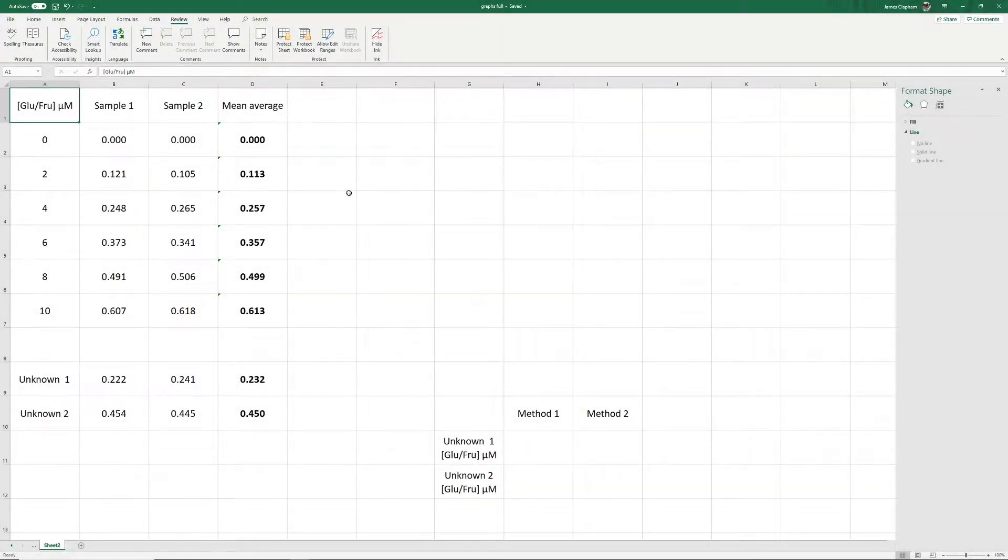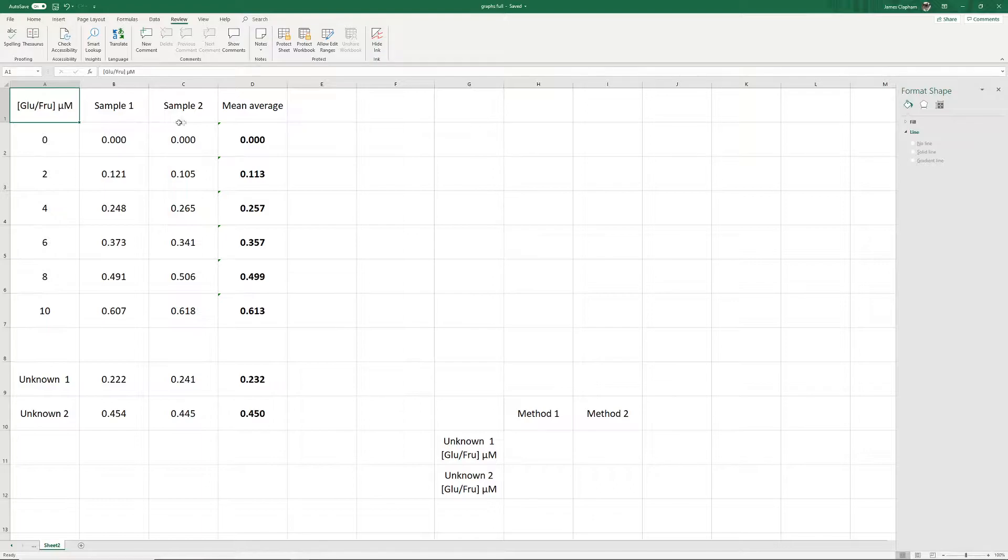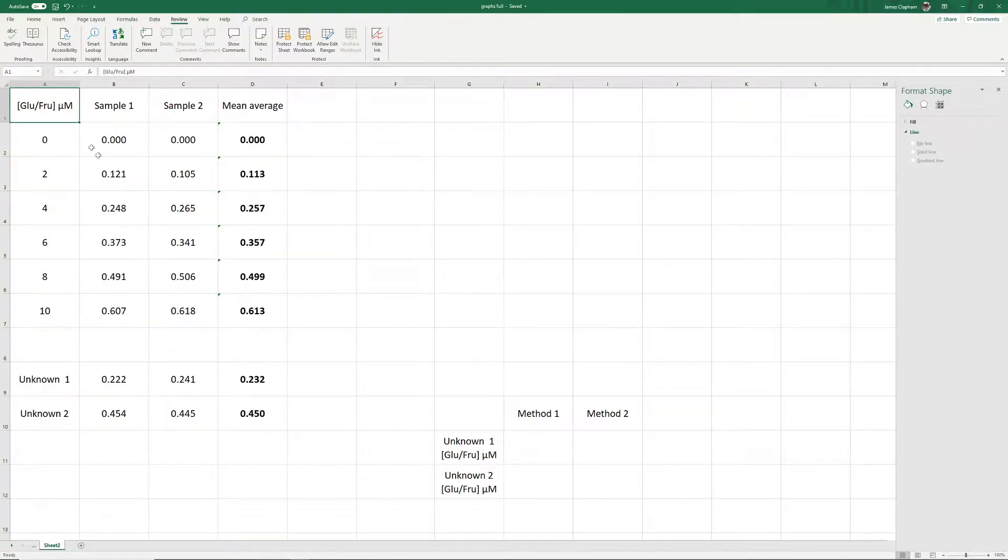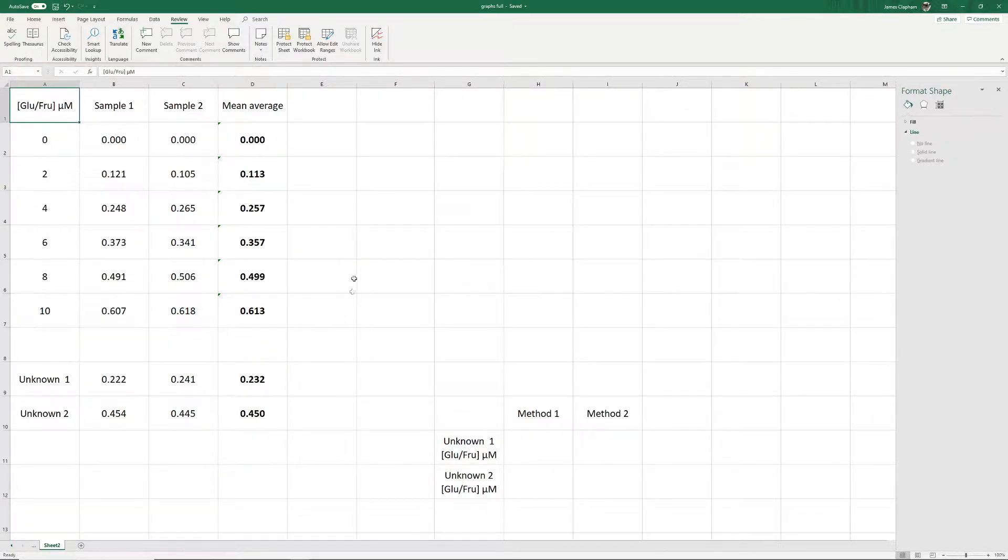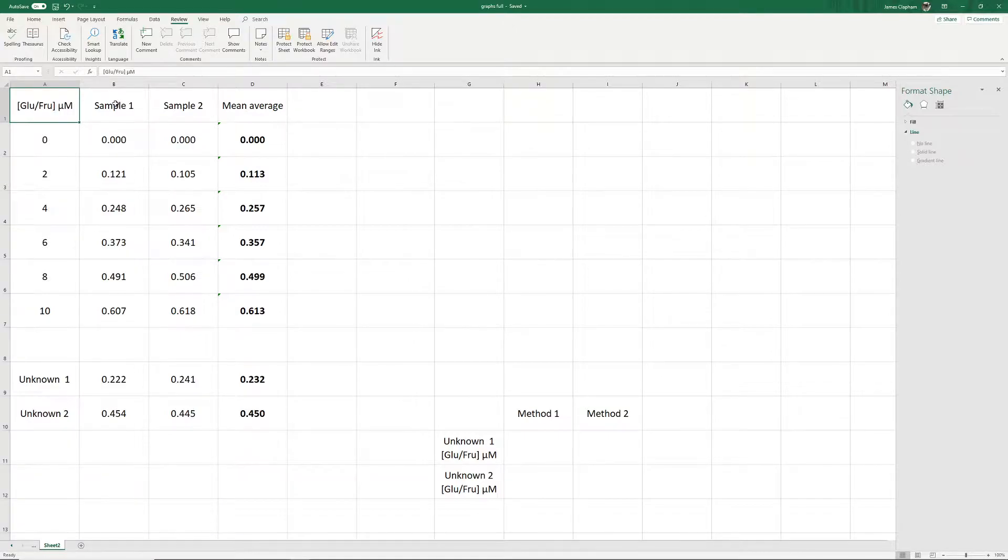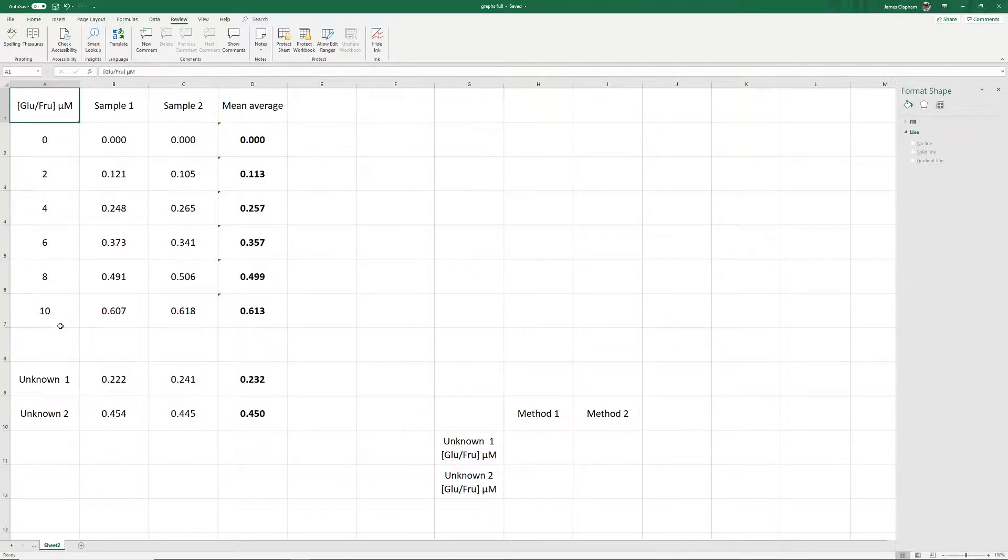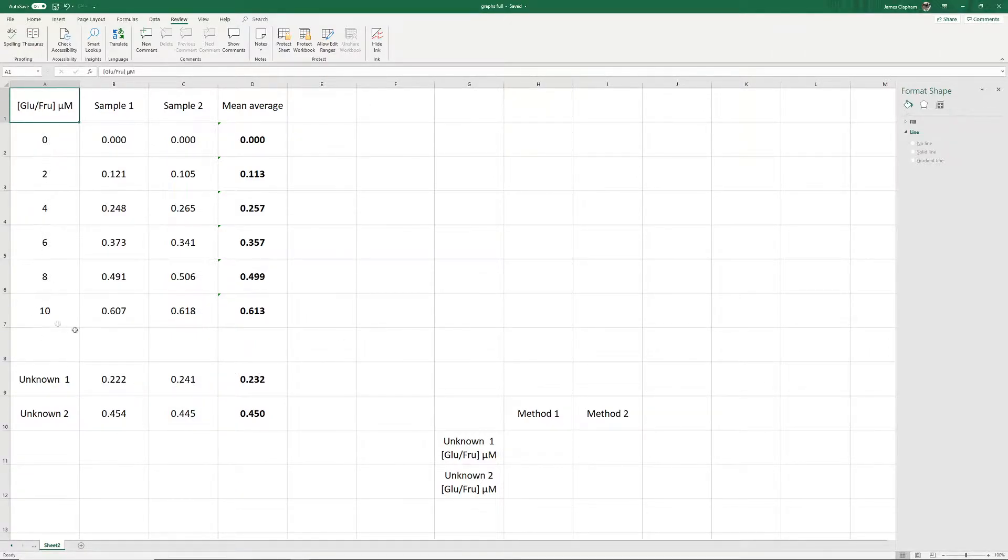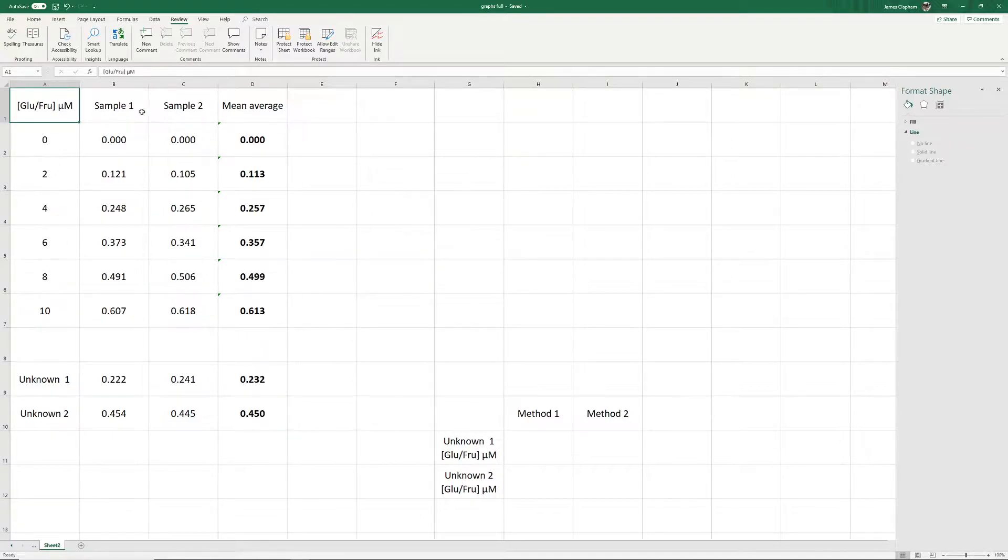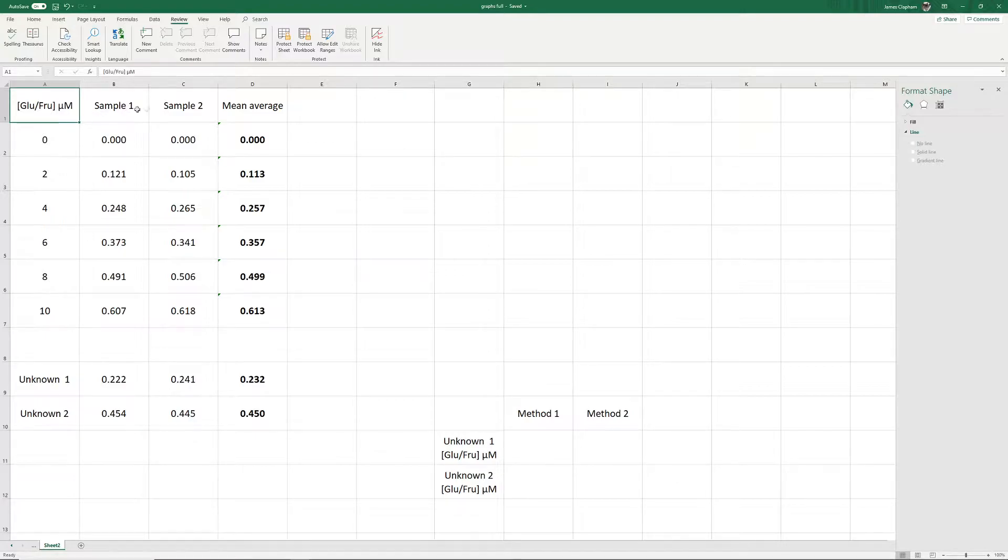Something we often have to do in lab analysis is construct a standard curve. This standard curve is a graph that's based on known values and the results you've obtained through the analysis procedure. Here we have a glucose fructose concentration in micromolar with a range of 0 to 10. We've carried out the lab analysis on these known concentrations and obtained these absorbance readings. We measured each sample in duplicate and taken an average.